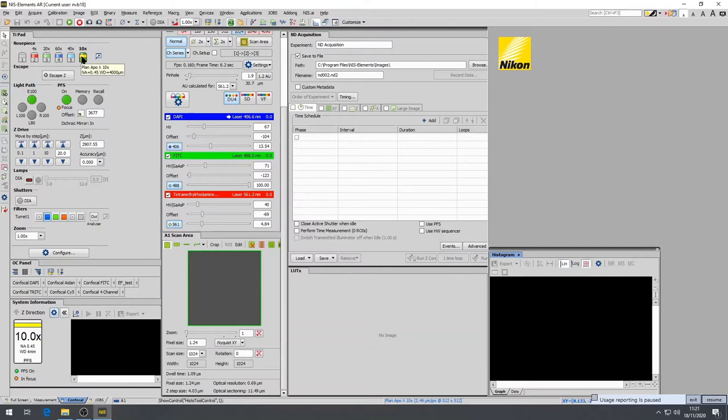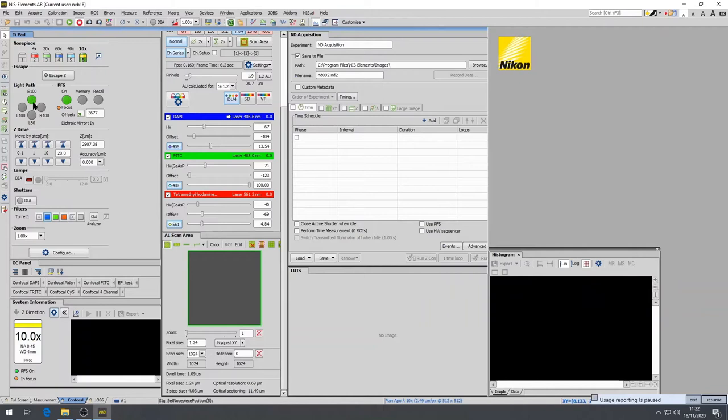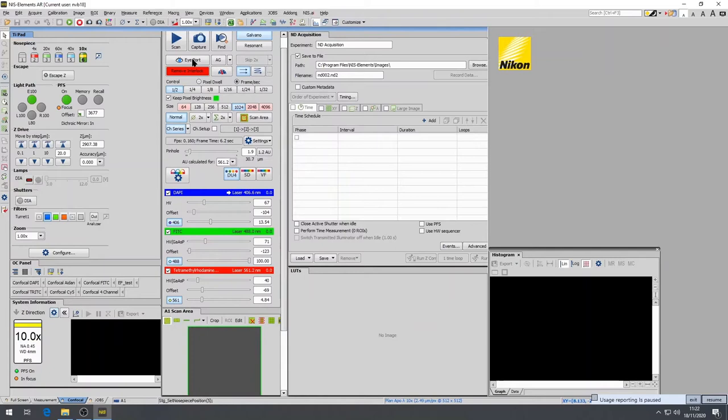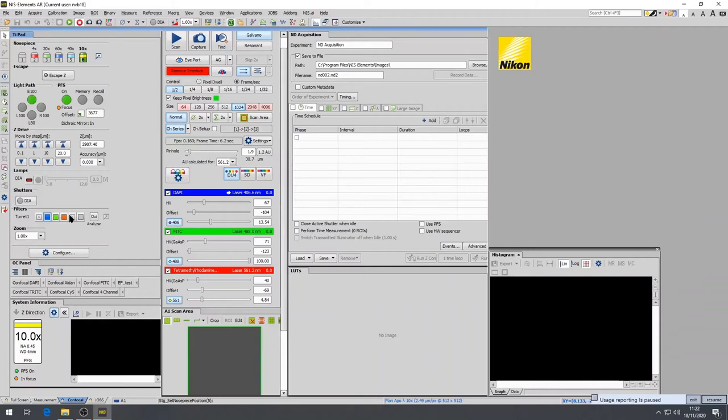To observe the fluorescence with your eyes through the oculars, you must put the A1R system into the wide-field configuration. This is done by selecting eye port or clicking on E100, meaning 100% of the light will be directed to the ocular. Select the filter you require by using the filter menu on the T-iPad window. This will default to the last filter used.